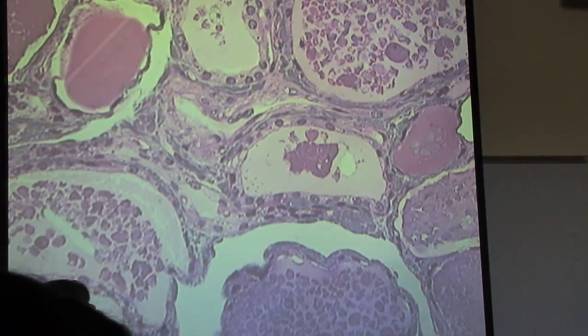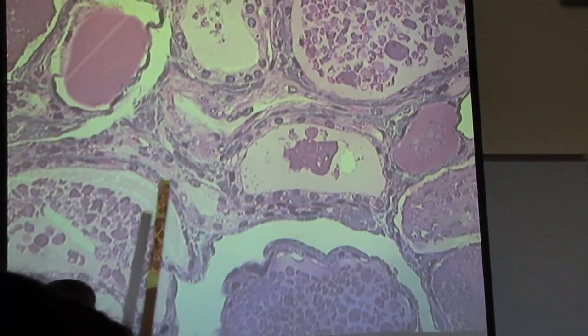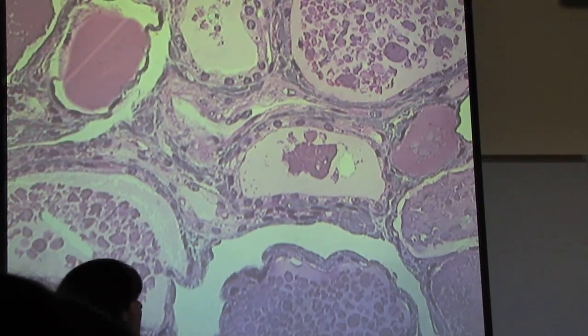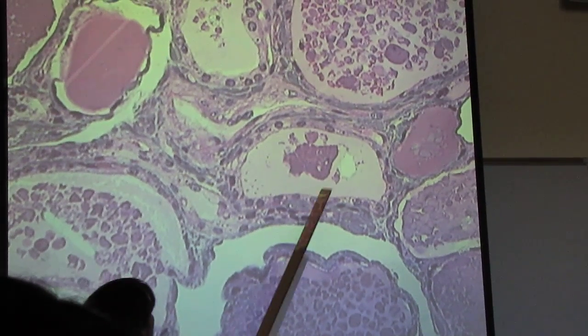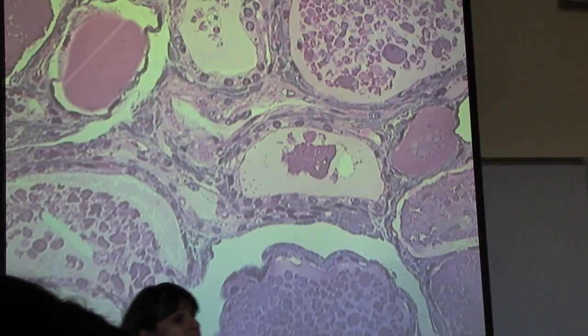That's a vein. It should have simple squamous on the inside. Yeah, and it's squished in there. But remember, we want to have capillaries right nearby. Here's a capillary right here. So that hormone can just go right into there and then eventually go to the arteries.